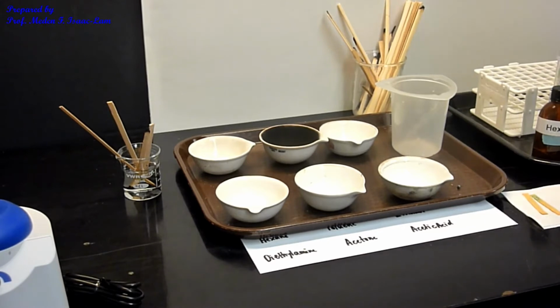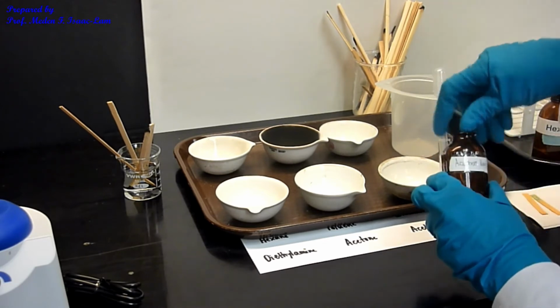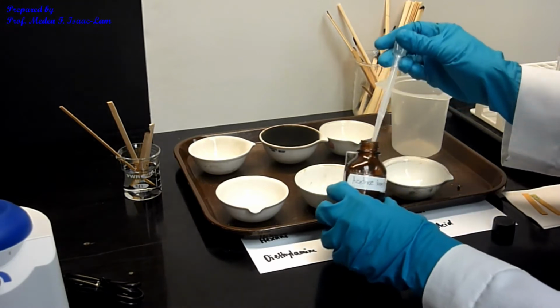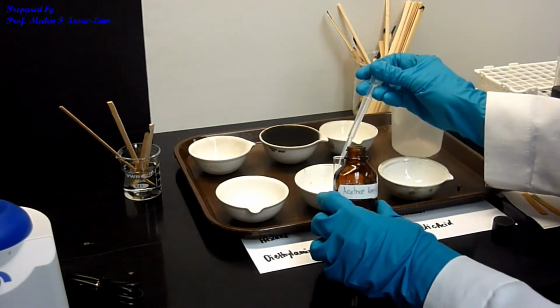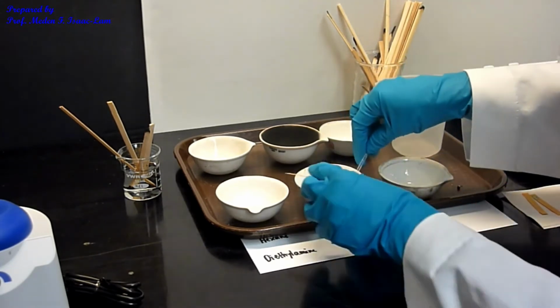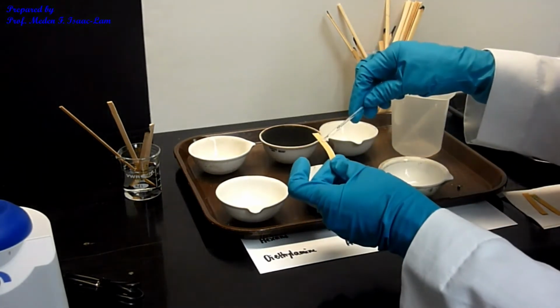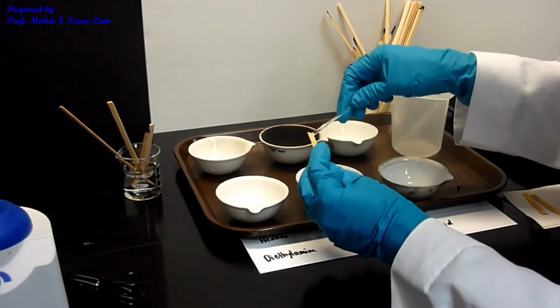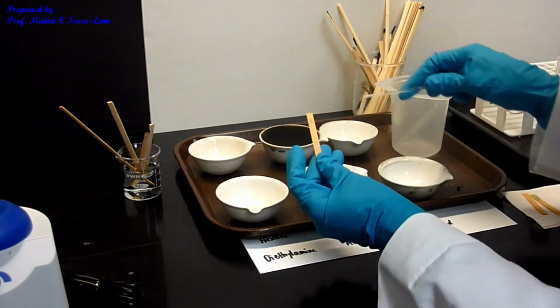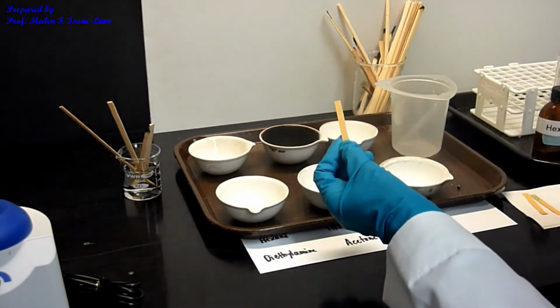Right. So now acetone. So we're gonna do acetone. So again, 8 drops. So that's acetone, and then again stir stick. Okay, so I don't see any color change.